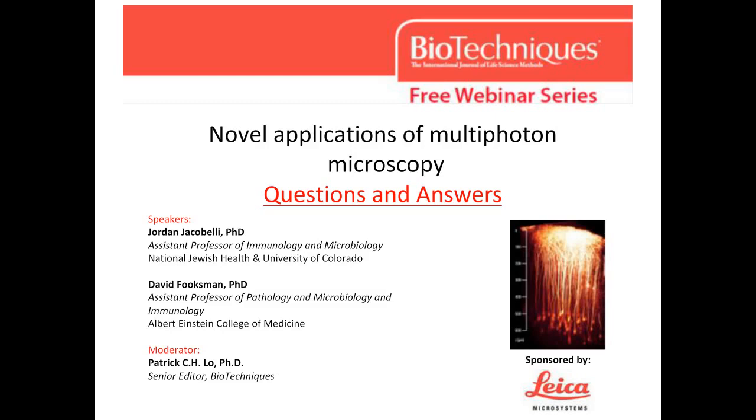There are certain labs that apply what people call an imaging window. So you fix almost like a glass coverslip to a certain area that allows you to go back over days, so that the mouse can then be woken up from anesthesia after an initial imaging session, and then a day later or a couple of days later you can go back and try to image the same spot. For immunology, we don't use that as much because the immune cells are so dynamic that the specific cells will move far away out of the imaging area that you're looking at. But for tumor cell migration, so tumor metastasis, that has been done. For example, the Condeelis lab has done a lot of that.